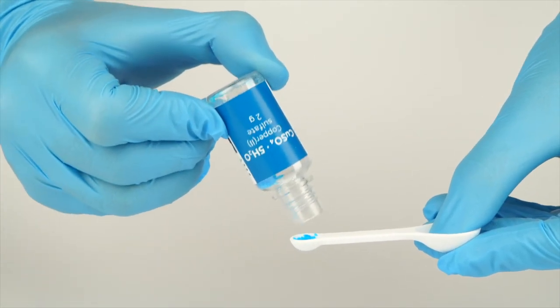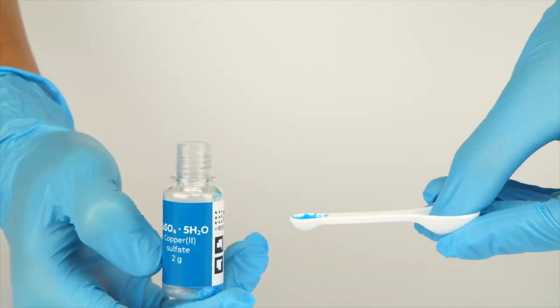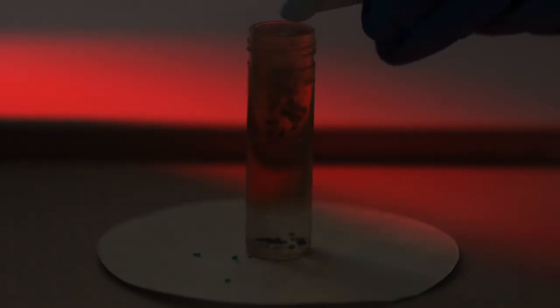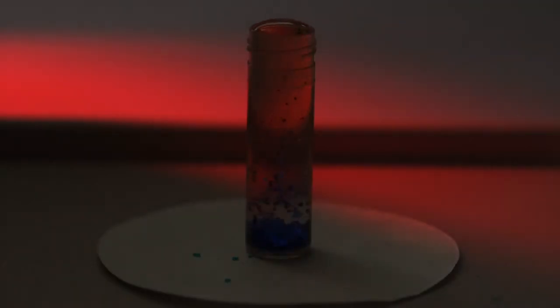Prepare a small spoonful of copper sulfate and turn out the lights. Add the copper sulfate to the vial and watch what happens.